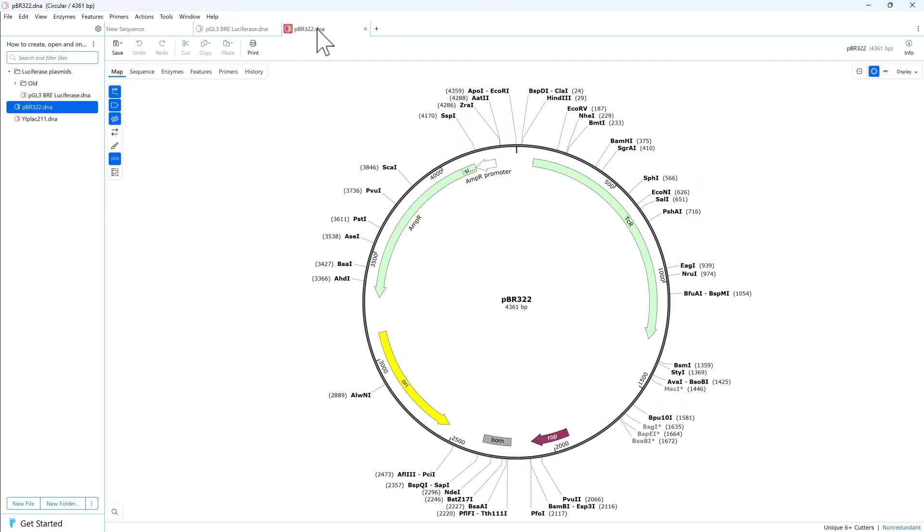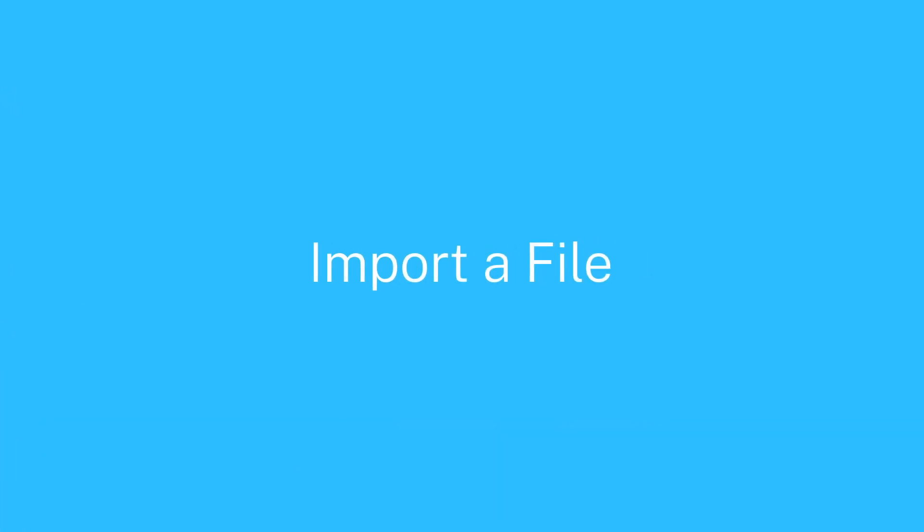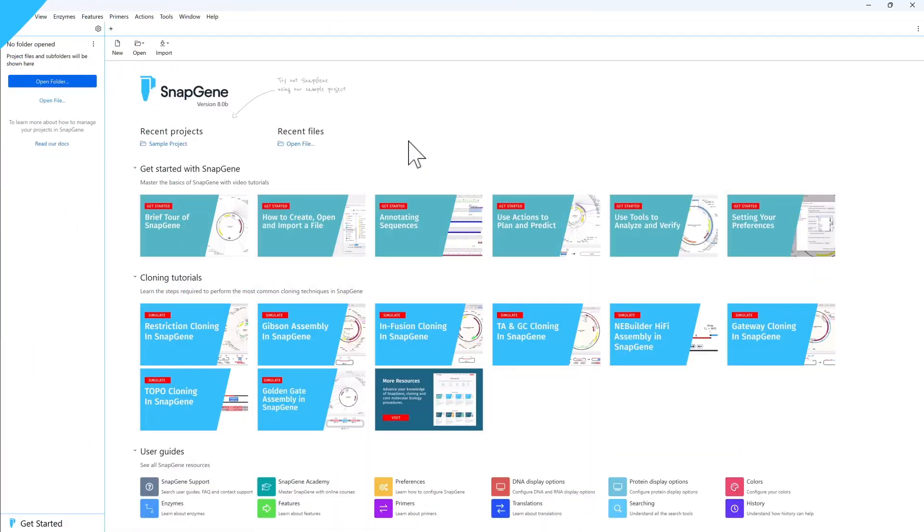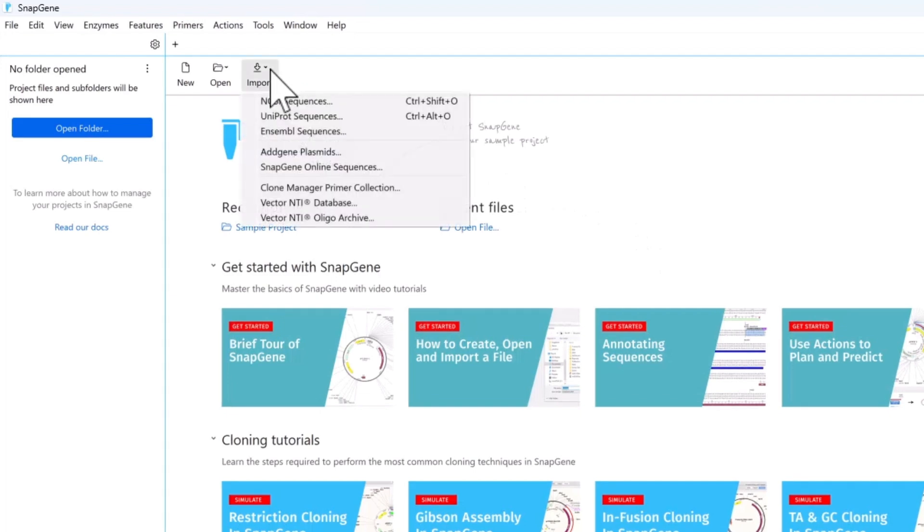You can open many common file types directly in SnapGene. The import option allows direct access to many online resources.